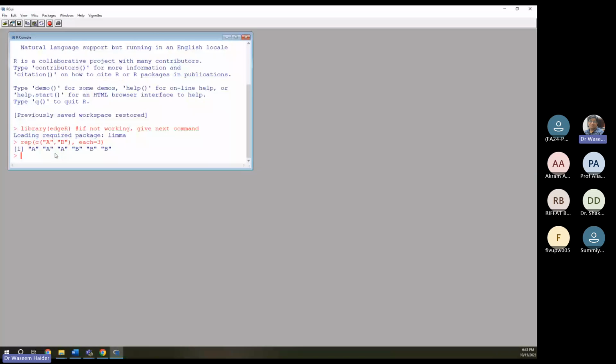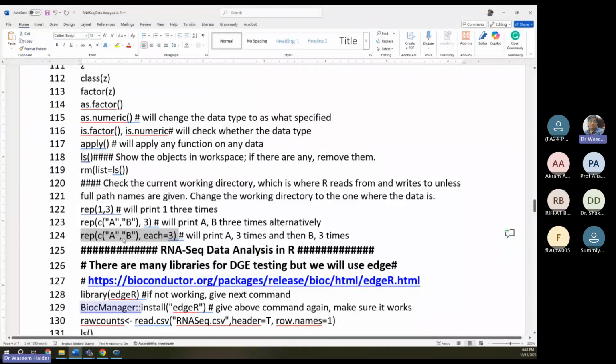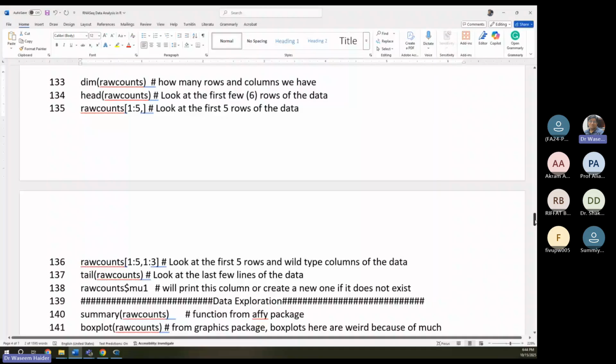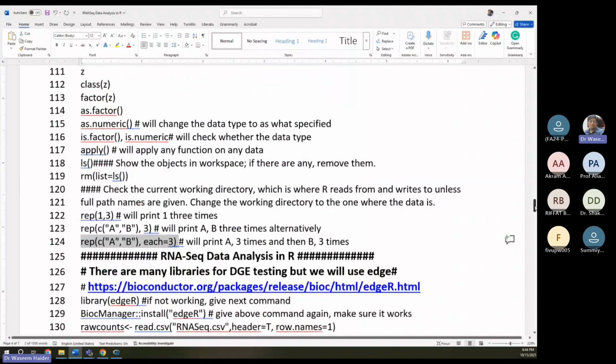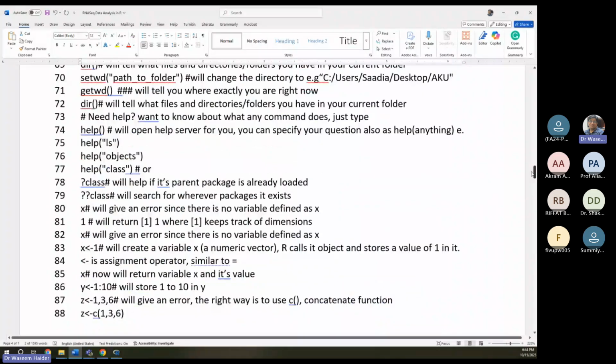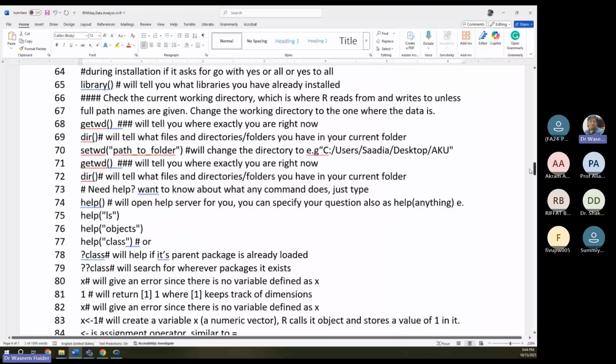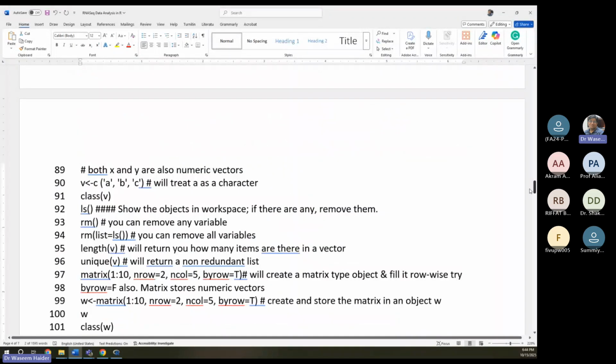So this way it will print. Basically, everything I'm using down there in this code, how these things work, the functions utilized in these codes, is actually explained here. And she says we practiced that before. But if not, it's really easy. You can go and practice these things yourself, and R will teach you those basics, right?